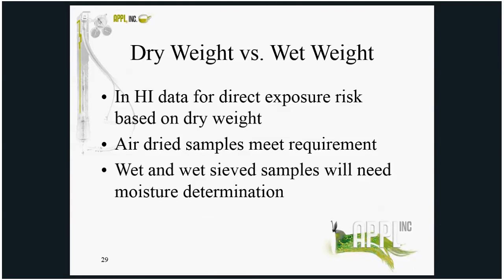Dry weight or moisture corrected results are required for most analyses in most states. If the sample is air dried, this criteria is met. If the sample's not air dried, as I mentioned before, you're going to have to take a separate aliquot to determine your moisture.